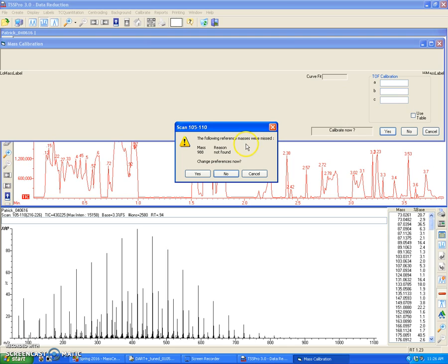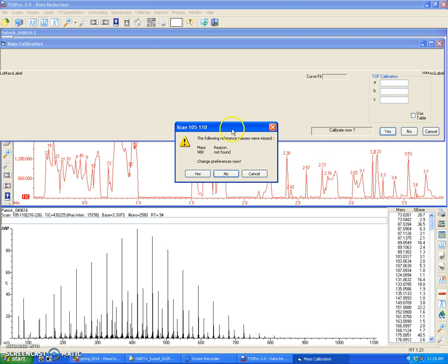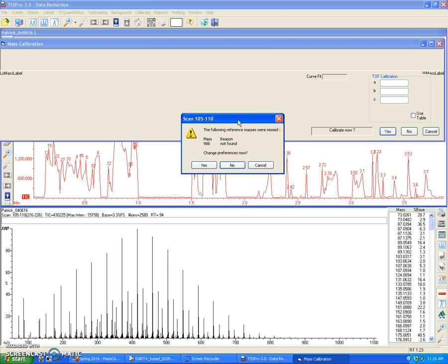This window may pop up where it says the following reference masses were missed, 988. That just means that the M over Z 988 is missing, and I don't need this region anyway, so I can ignore that. In any case, you just have to click no. You don't have to change preferences just because this calibration file takes into account a large mass region. Just click no.